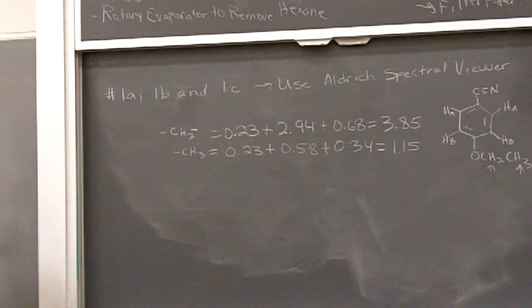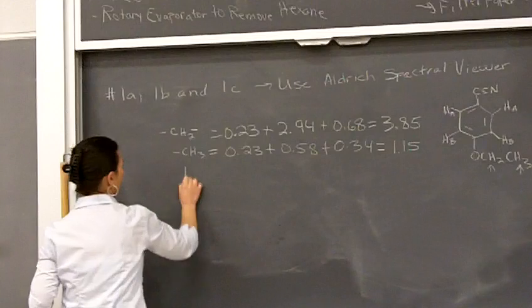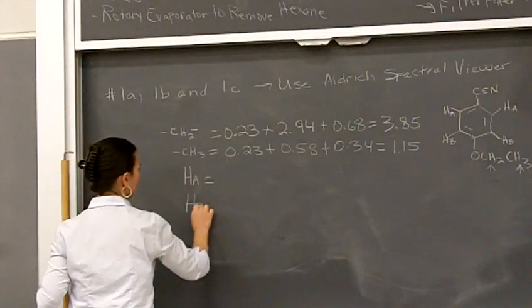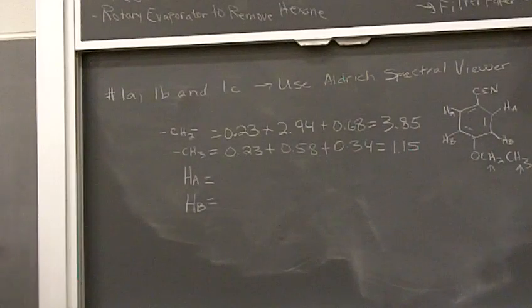Everyone good? Good there? Okay, so now I'm going to look at the aromatic protons. We've got to use a different table to do that, all right?